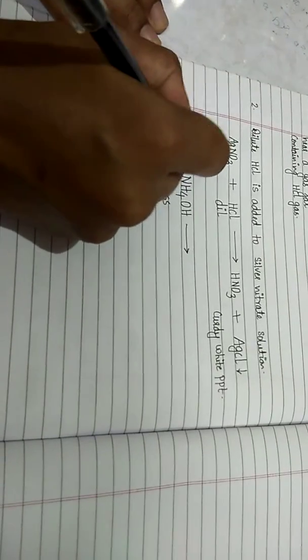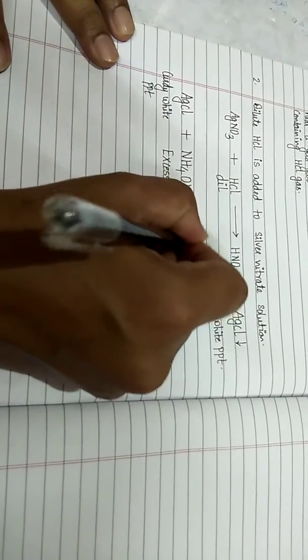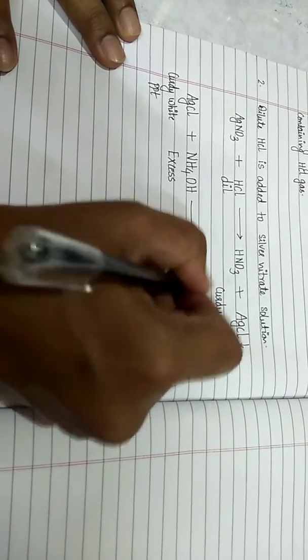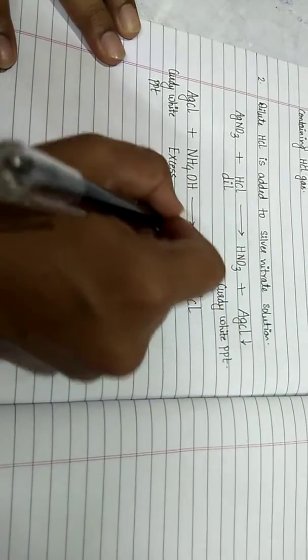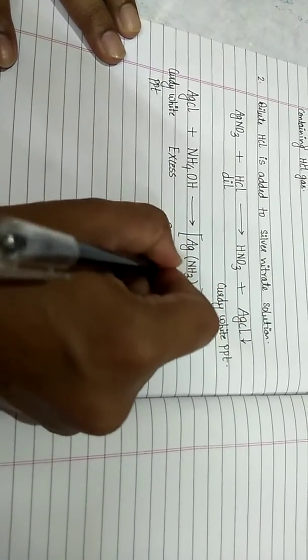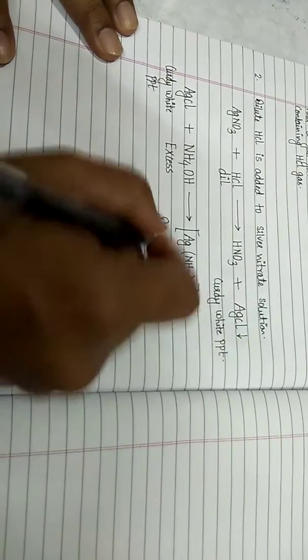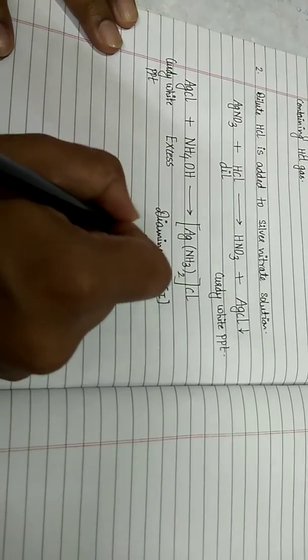Now this curdy white precipitate dissolves in excess of ammonium hydroxide to form a complex salt named diamine silver 1 chloride, and this is colorless.